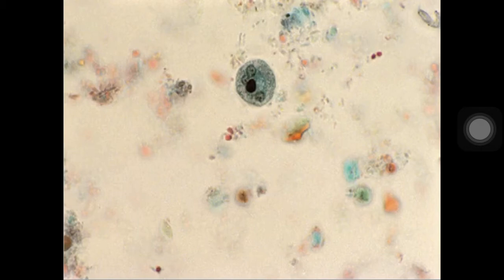So this one basically on my resource, on what I've obtained from the different resources that I've mentioned nga po earlier. So this one is Entamoeba hartmanni. So Entamoeba hartmanni is known as the small race of Entamoeba histolytica. So halos morphologically similar din po sila. So it generally resembles Entamoeba histolytica, but Entamoeba hartmanni is a non-pathogen. But to differentiate them mainly is based on their size. Kasi mas maliit nga po si Entamoeba hartmanni. So size is a major determinant in differentiating your Entamoeba histolytica from Entamoeba hartmanni.